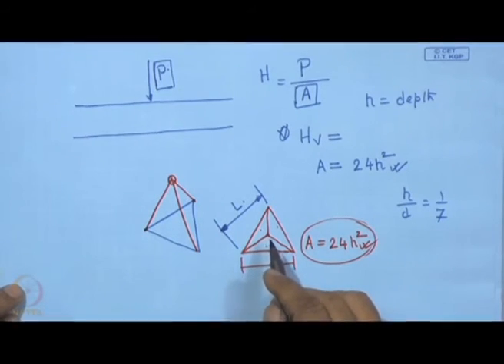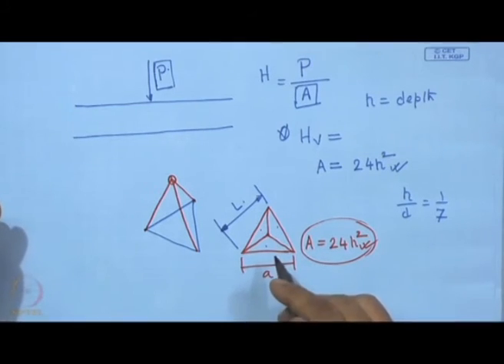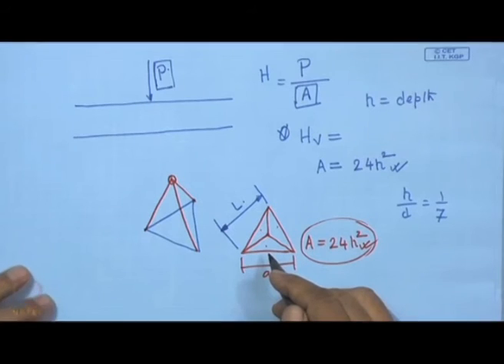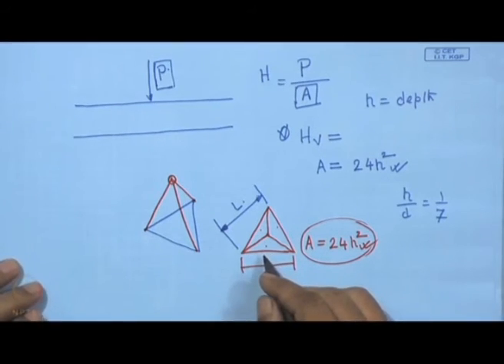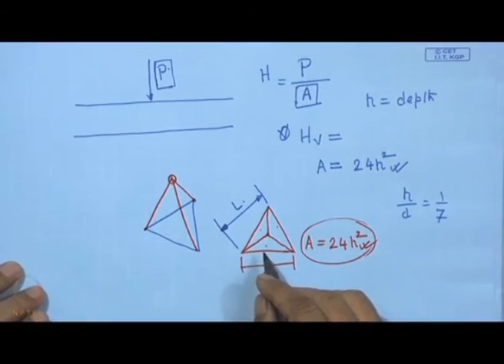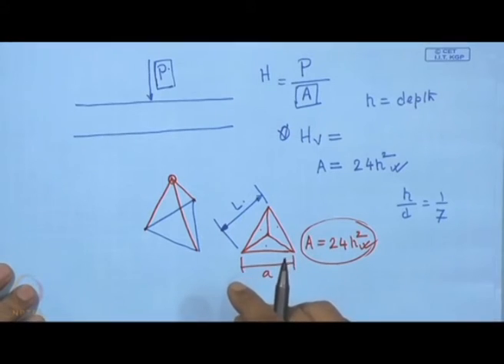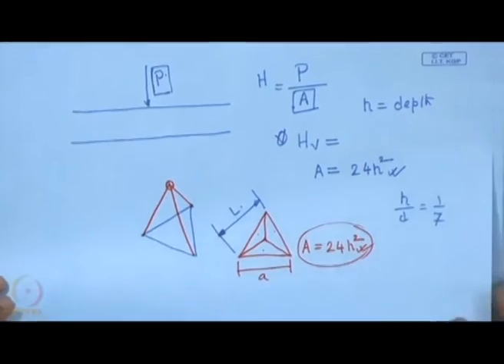But with the four sides of a square based pyramid, it is not necessarily true that all four sides will meet at a point, and that becomes an error which may creep into the indenter itself and can affect the precision of measurement.